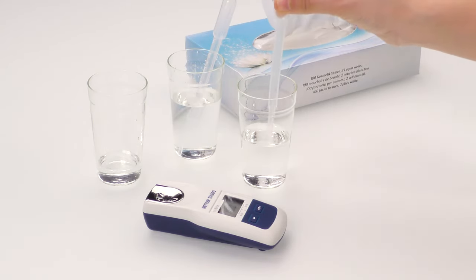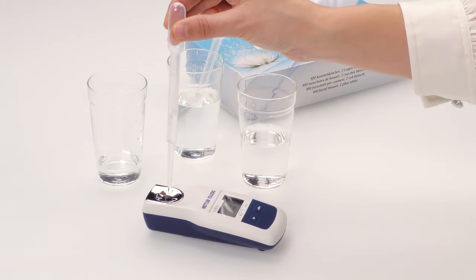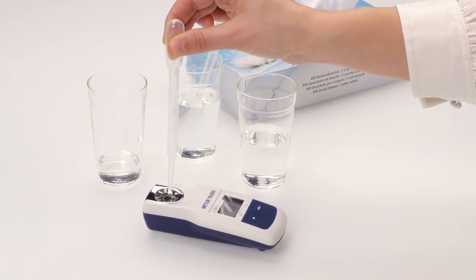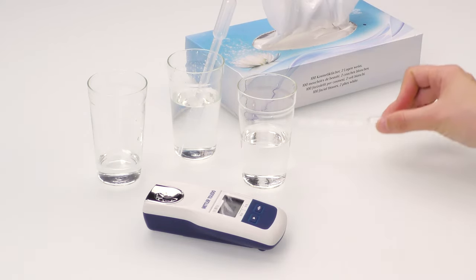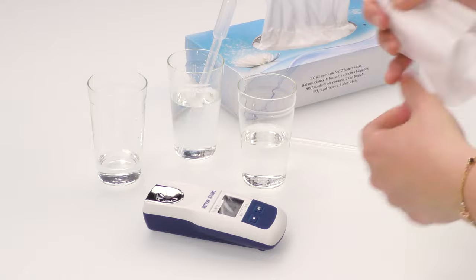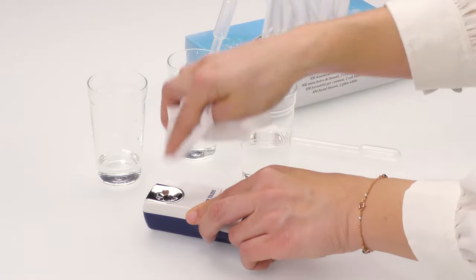Clean the cell thoroughly with pure water. With a lint-free tissue, dry the cell properly.